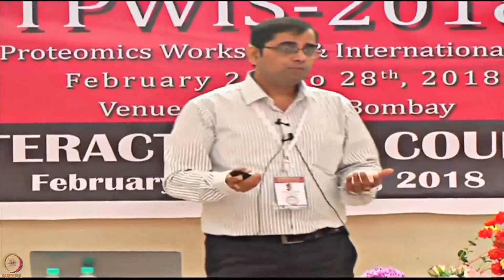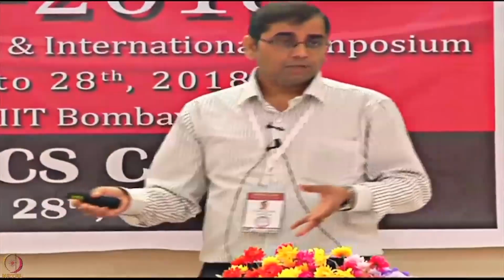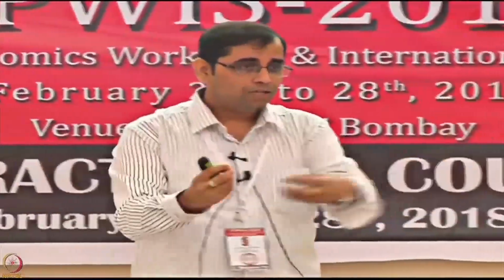And of course, if you have a huge amount of funds available for the project, then you can do everything on the same platform. But otherwise, you can mix and match and choose which technologies can give you what. Sometimes a good experiment may involve every technology we are studying in the different workshops right now, starting from discovery with mass spec based and microarray based approaches, taking those leads forward and then validating using these label free platforms. So everything has its own utility, and you have to pick the technologies in the right context.